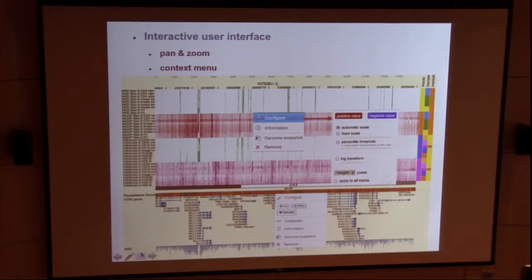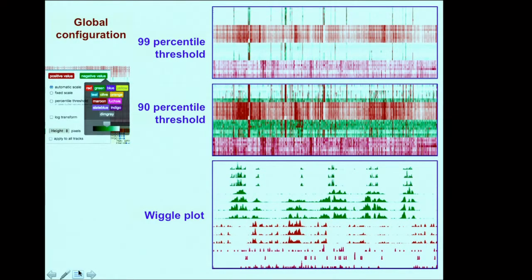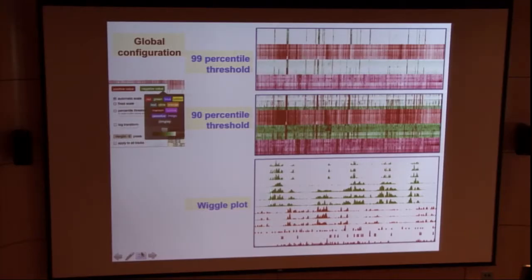And lots of user control. Basically, this part really gives the investigators full control of this tool. You can use whatever color you want. You can change the height and different thresholds. By changing the threshold, you in a way get around the peak finding problem, right? Instead of showing the peaks, you show the raw data. You change the threshold, you essentially define your own peaks. So this is the data at different thresholds.